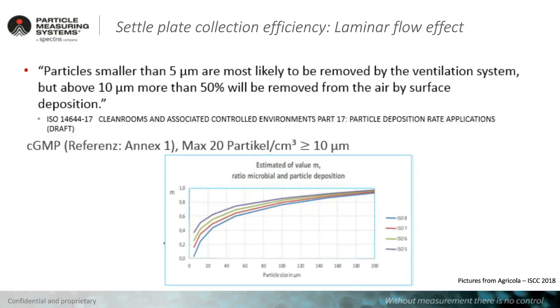Taking this into account, we should go and visit a new standard that is just about to be released. It is the ISO 14644-17, which is still in draft shape, and I do believe in 2020 we will see the publication becoming ready.